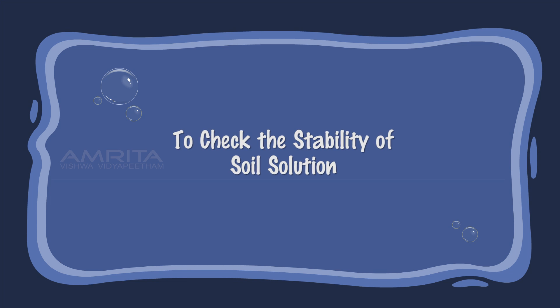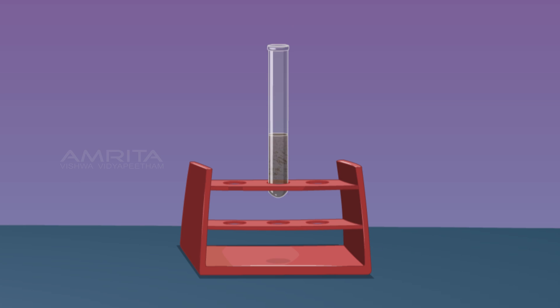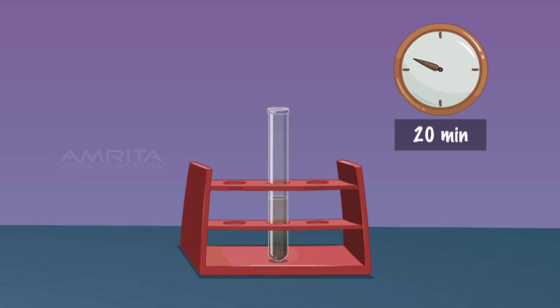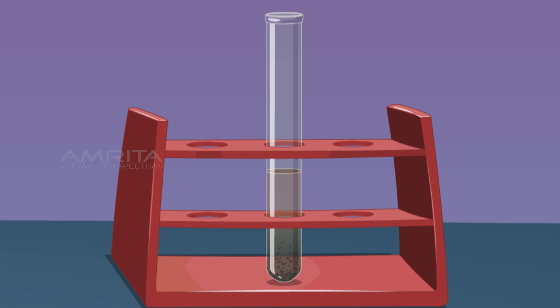To check the stability of the soil suspension, take some soil suspension in a test tube and leave it in the test tube rack for 20 minutes. You will note a gradual settlement of soil particles at the bottom of the test tube. This indicates that a suspension is unstable and shows settlement of heavier particles.